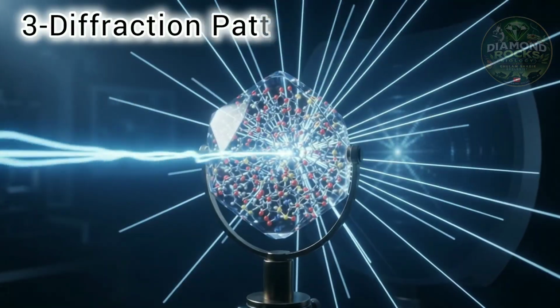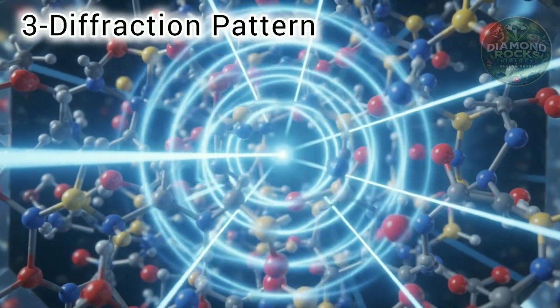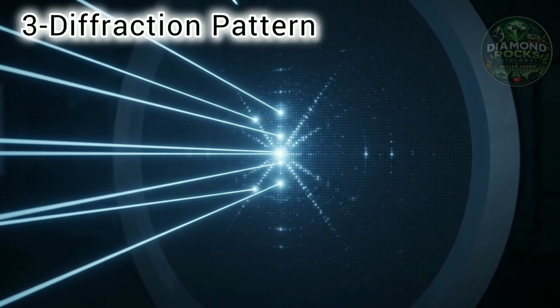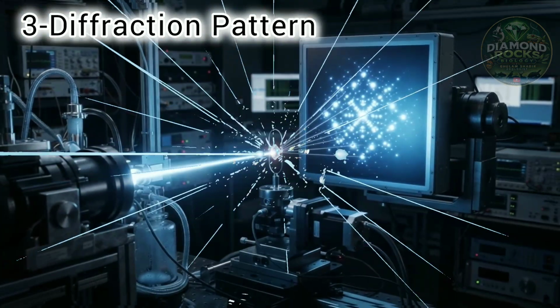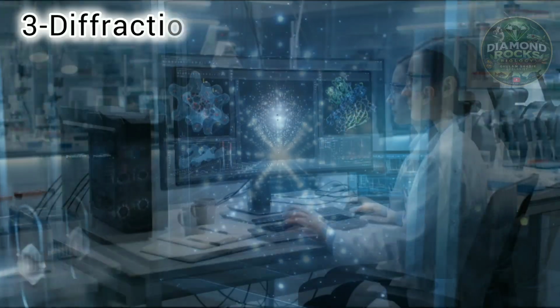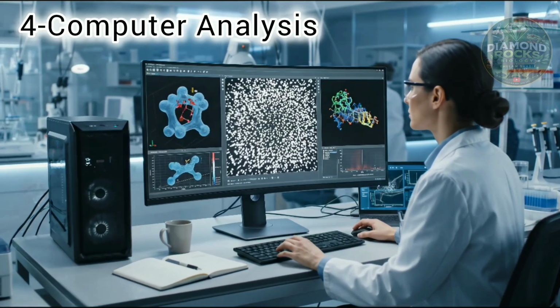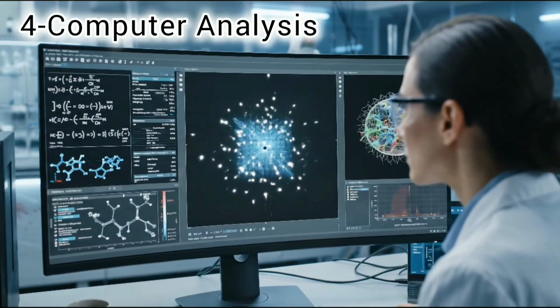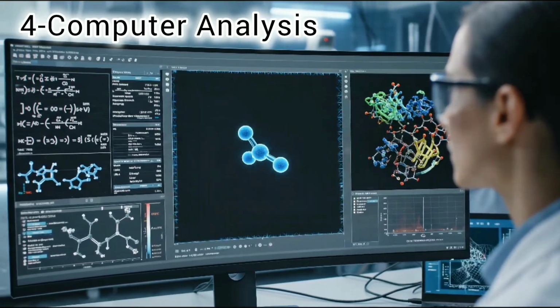3. Diffraction occurs. The atoms in the crystal cause the X-rays to diffract in different directions. This produces a characteristic pattern of spots called an X-ray diffraction pattern. 4. The pattern is analyzed. Scientists use mathematical calculations and computers to analyze the positions and intensities of the spots.